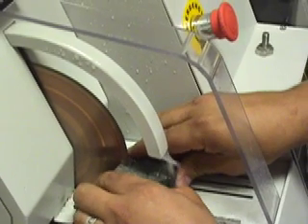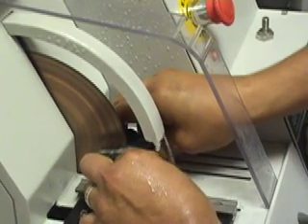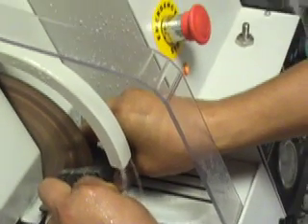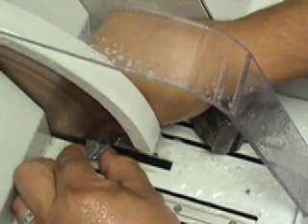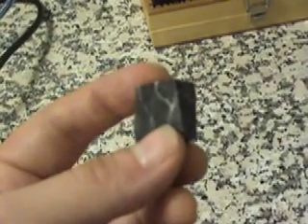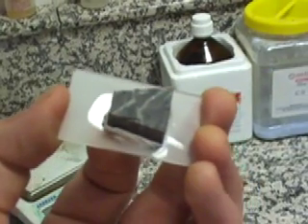First, use the diamond blade to cut a large sample into a smaller piece. Texture the surfaces to be bonded to ensure a good key for the adhesive — do this to the sample and the slide. Then bond the sample to the slide.